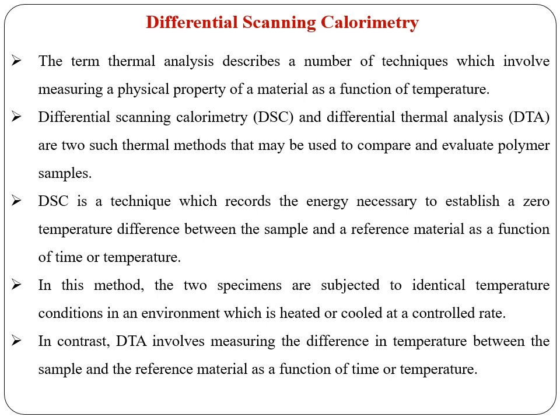In this method, the two specimens are subjected to identical temperature conditions in an environment which is heated or cooled at a controlled rate. In contrast, DTA, that is differential thermal analysis, involves measuring the difference in temperature between the sample and the reference material as a function of time or temperature.